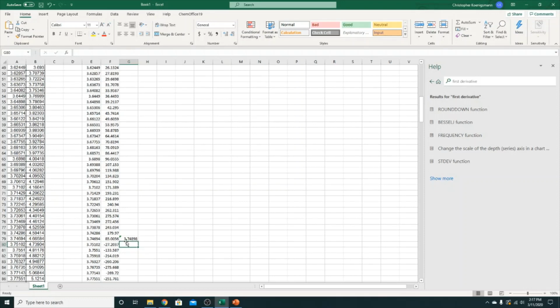Now, in terms of sig figs, the best volume we can measure is out to two digits. So we can measure 3.7 something. So to estimate this data, I would estimate this as 3.75. And you'll notice that that's pretty much right in between. So in the accuracy of our experiment, using this average technique is a pretty good approximation, given that we can only go to two decimal points.